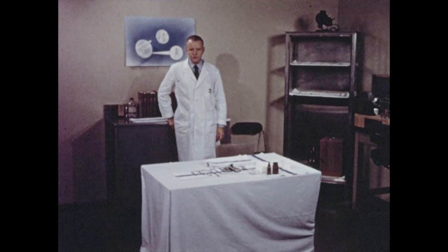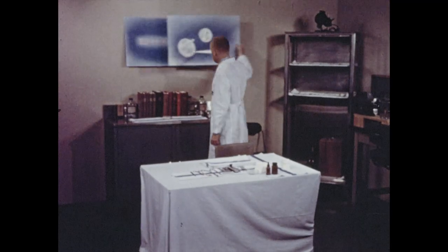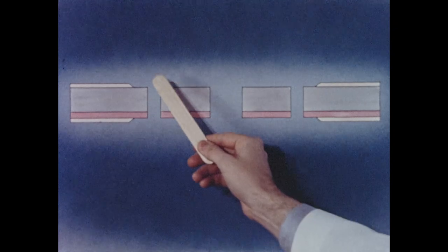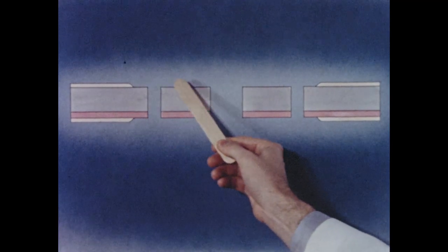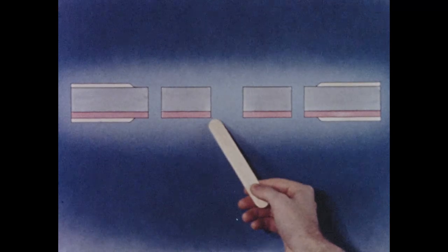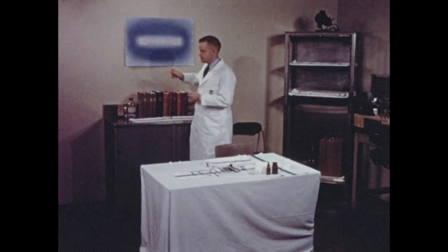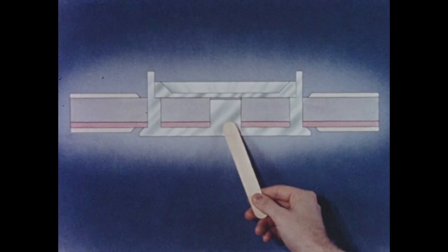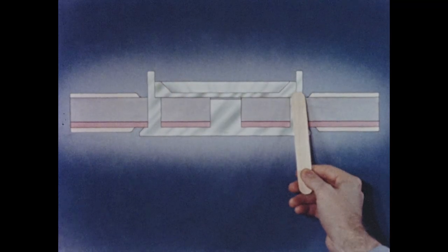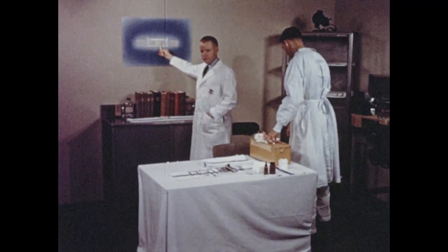The surgical technique by which the plastic chamber is installed in the ear is relatively simple. Holes are punched completely through the ear. Next, the skin is carefully dissected and removed from the inner and outer surface of the ear in the area into which the chamber will be inserted. It is imperative that the cartilage and blood vessels be left intact. Finally, the chamber is installed and cemented in position. This is the area into which tissues will grow and later be used for microscopic examination.